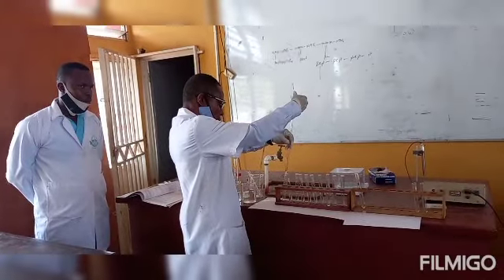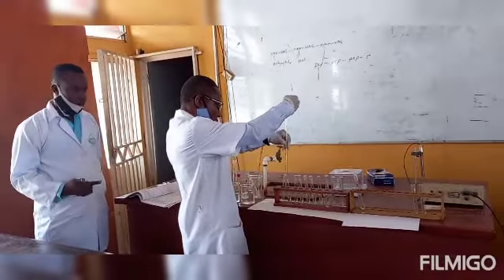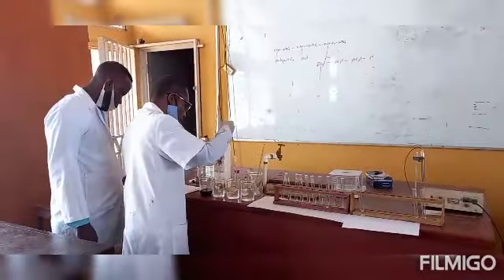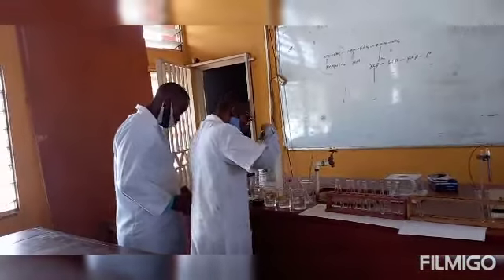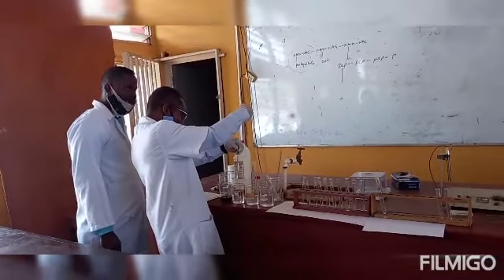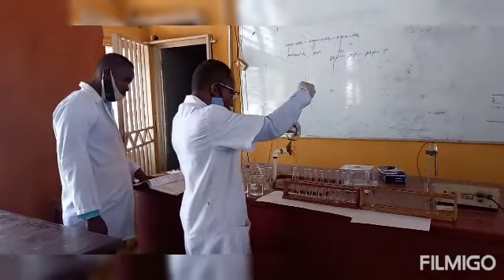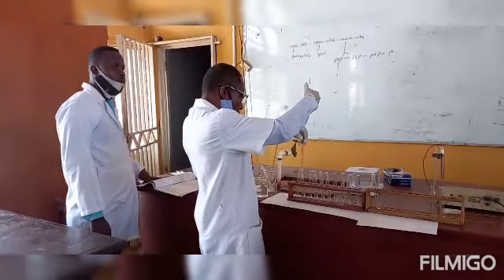That's how you will continue the procedure stepwise until you are able to prepare all the 11 test tubes. The 11 test tubes, after adequate preparation, will serve as our standard preparation.